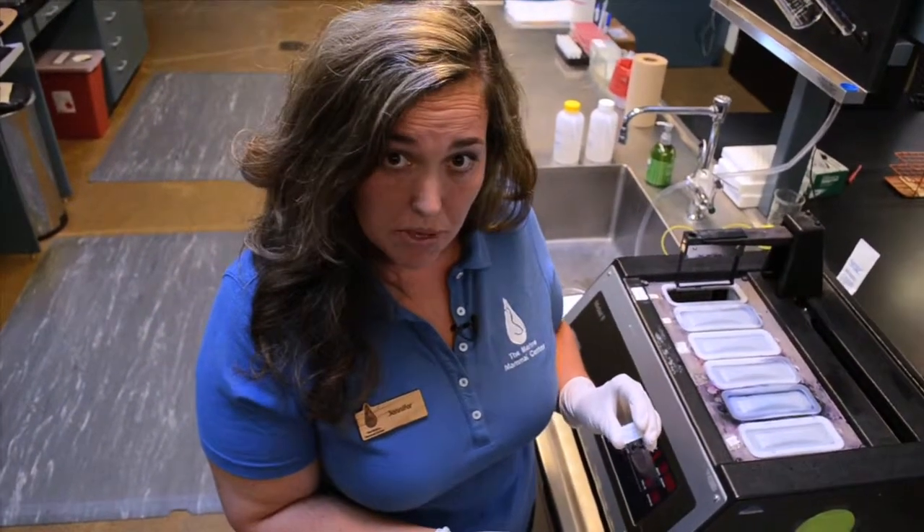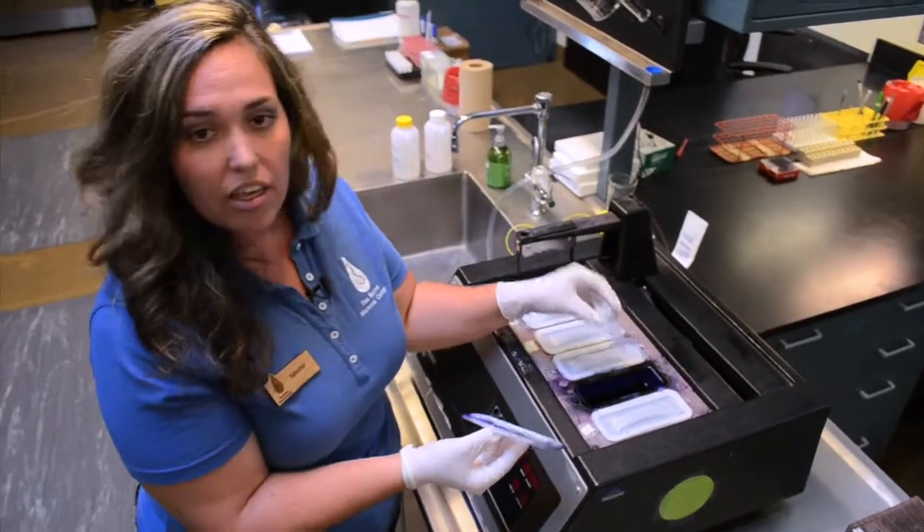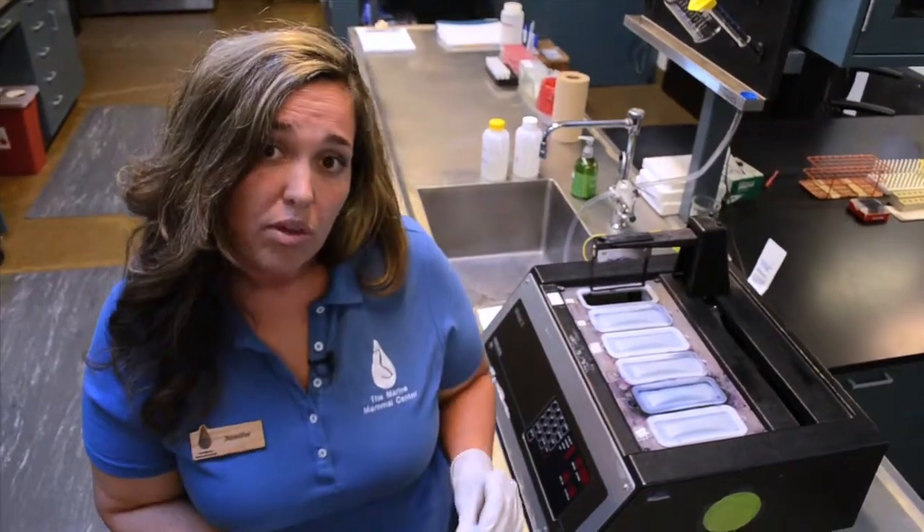Once we've prepared our slide with our smear, we're going to go ahead and stain it. That's done simply by putting it into some ink and preparing it through this process so that we can review it underneath the microscope.